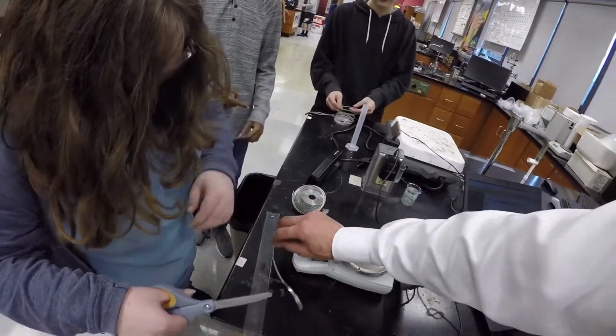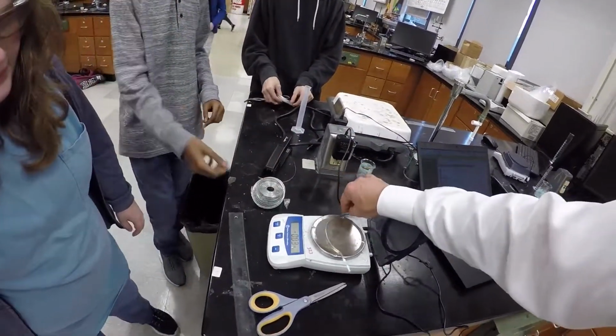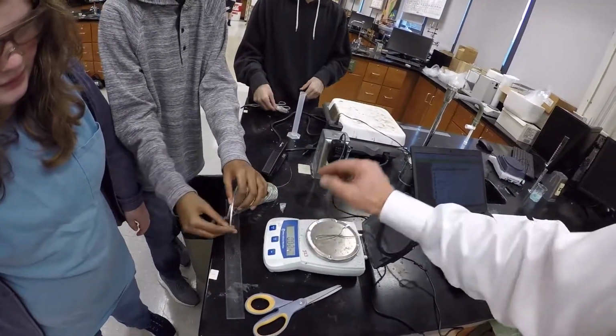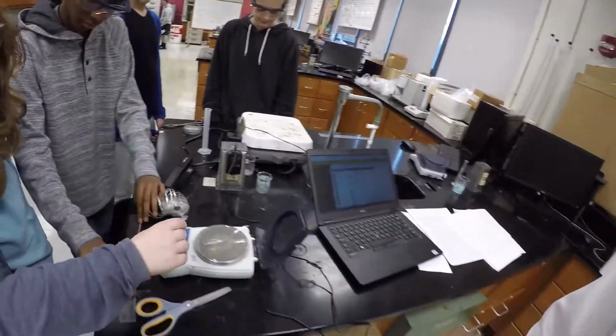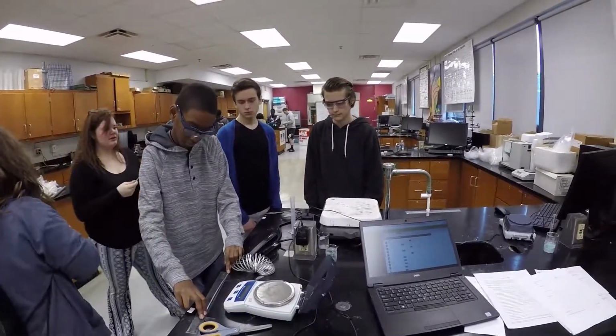And then you put it on the balance right here. Write down the mass. About 0.51.